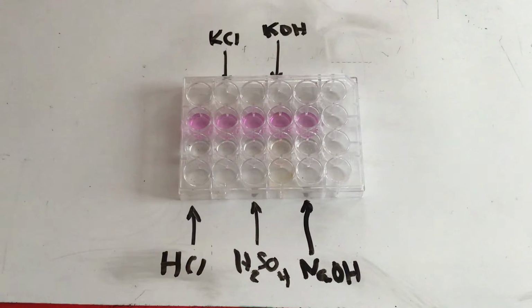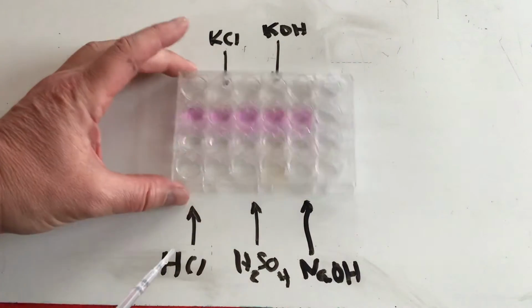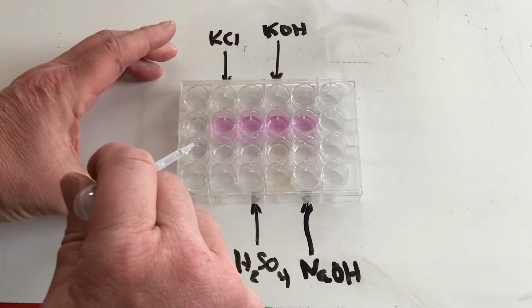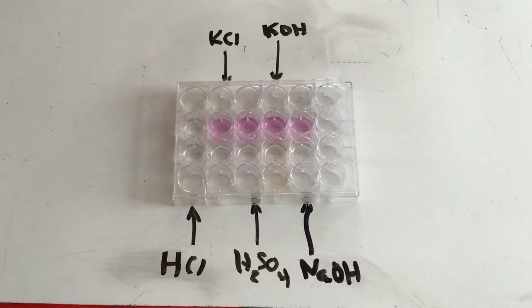So we'll start with the hydrochloric acid, and I just gave it away, hydrogen chloride, HCl. One drop there turns the pink phenolphthalein clear. I can put several drops in here, nothing happens when I do it to the clear. That was HCl. Now we can use KCl.